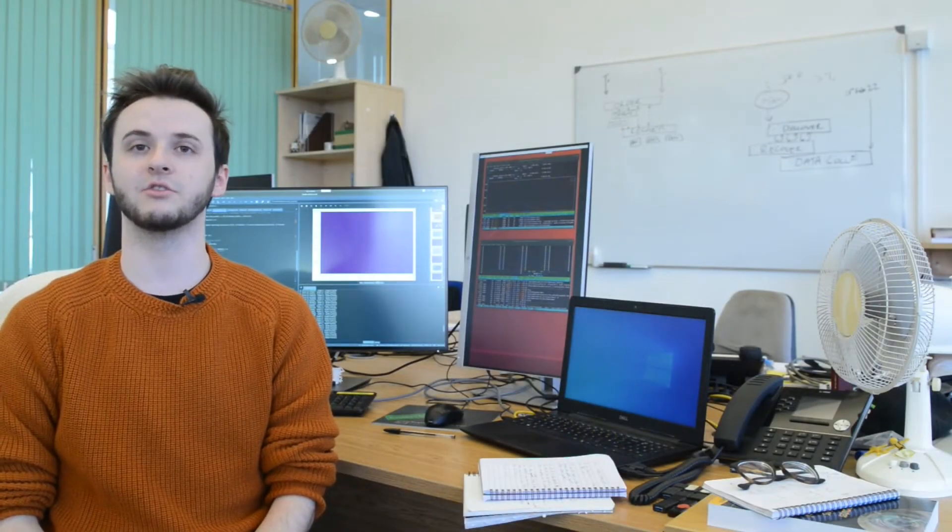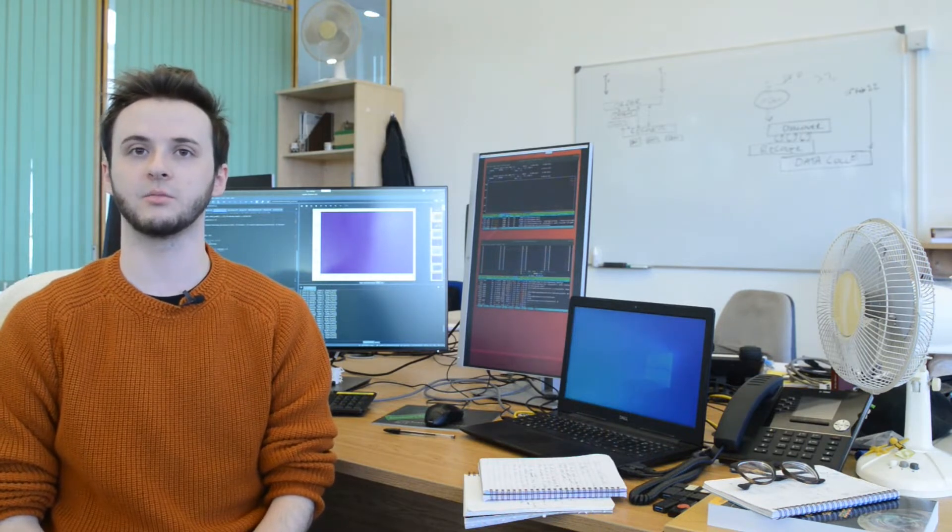As a result, AI assist has seen real prints across a range of different reagents and different substrate types. We did this to give it the best possible chance of helping you in whatever your casework might contain.